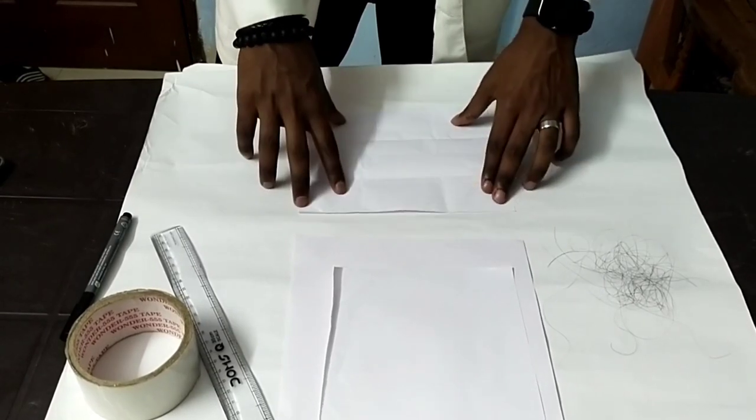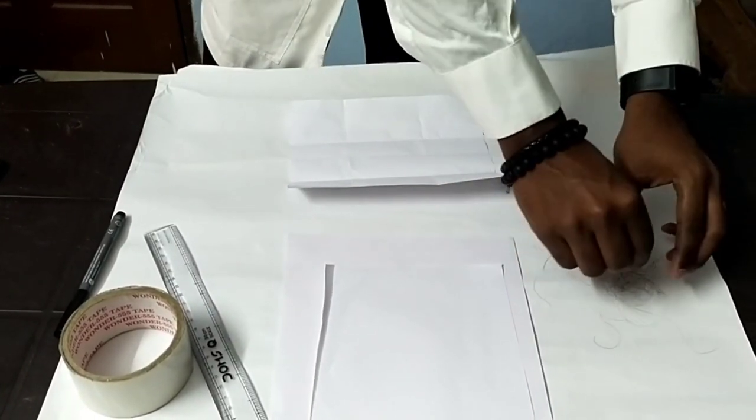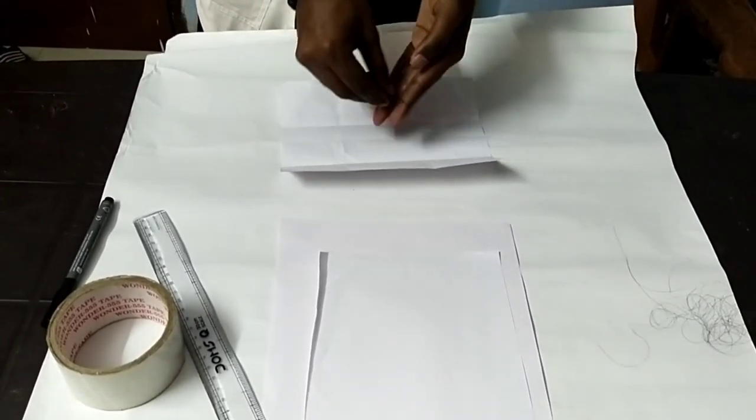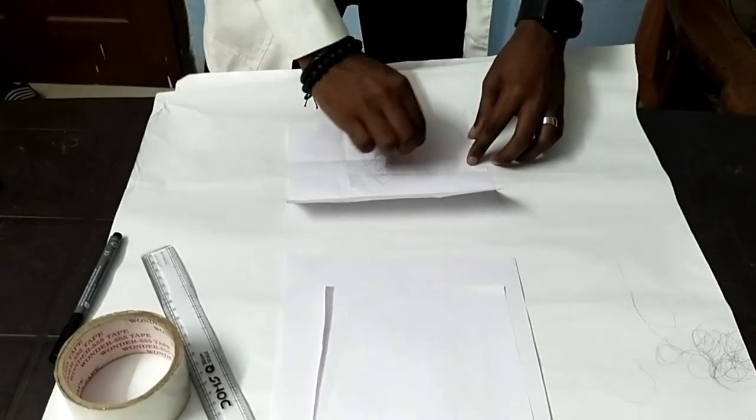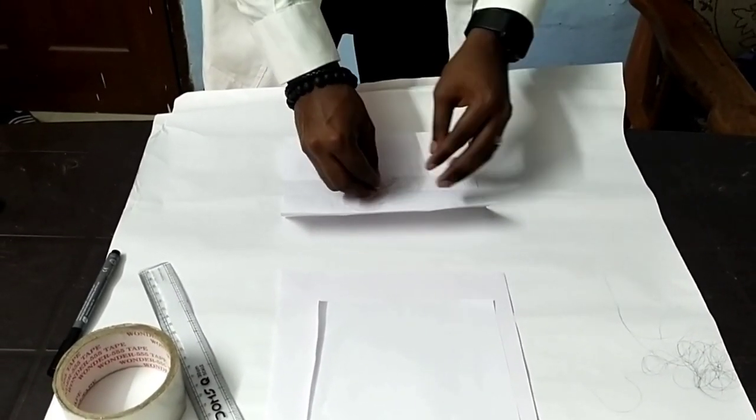Place the hair sample in the center of the square. So I have taken a bit of hair samples. Now I would like to take this pinch of hair sample and place it inside the center of this paper.